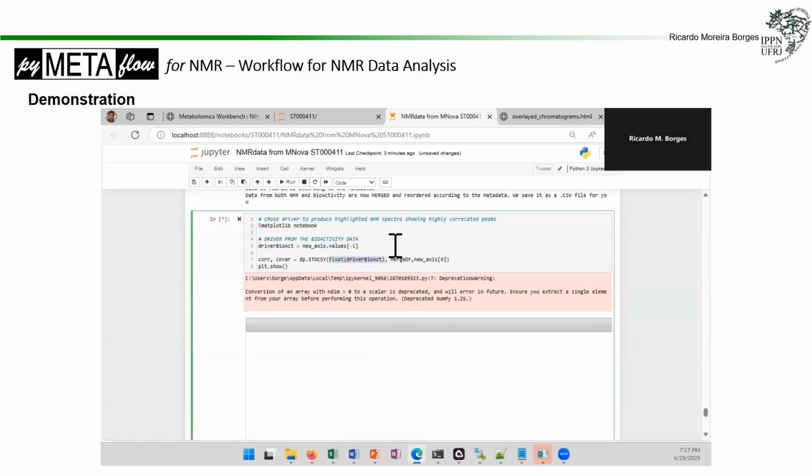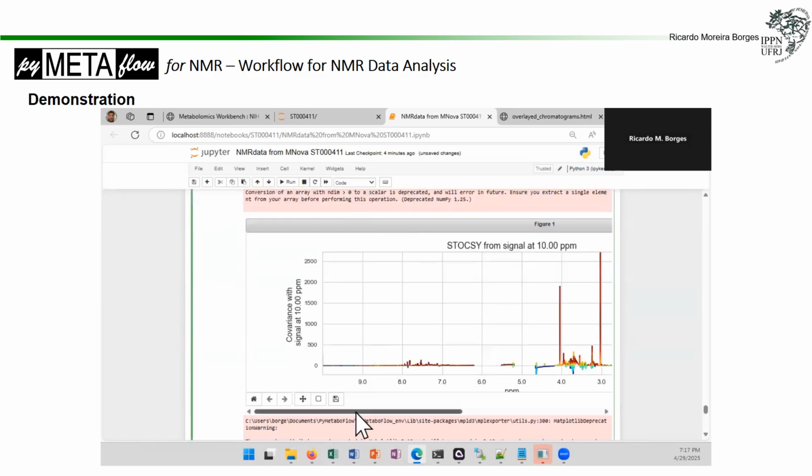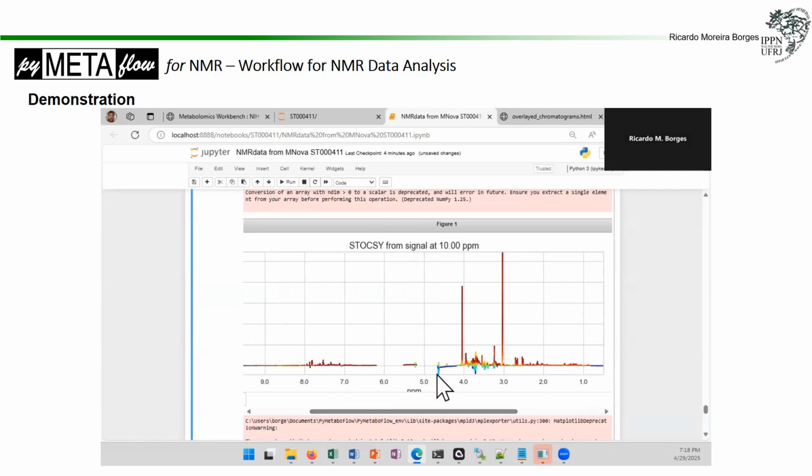So what I'm doing is basically asking for the bioactivity, which are the NMR features that are related with that. And that's very helpful, specific for natural products. For some metabolomic study, you can use the classification analysis, that would be the phenotypical analysis, and create a vector for that, and then you calculate the correlations to get the NMR profile of the highly correlated peaks, right? That's the image produced, and that's it.